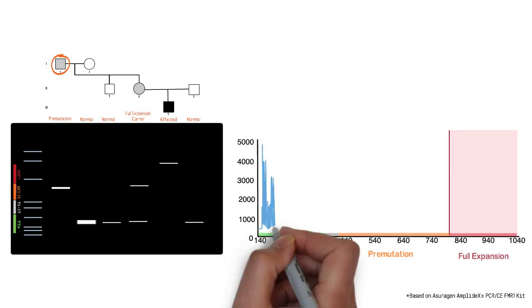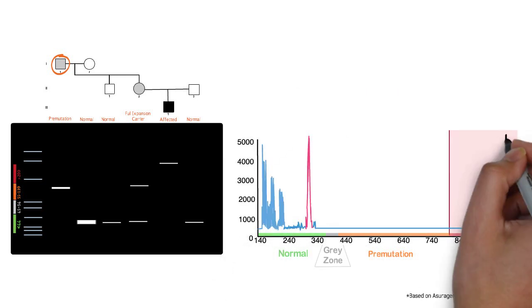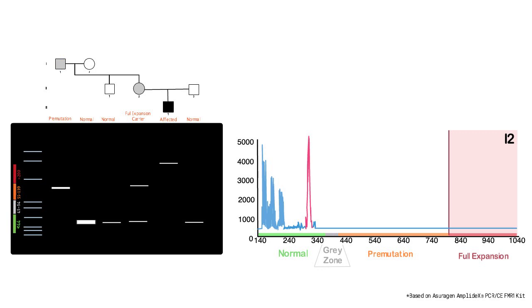This next electropherogram depicts a typical output for a normal female. There is a small ladder present, however, the peaks are confined to the green zone of fewer than 44 repeats. The largest peak stems from the standard forward and reverse primer amplifying the full repeat region.